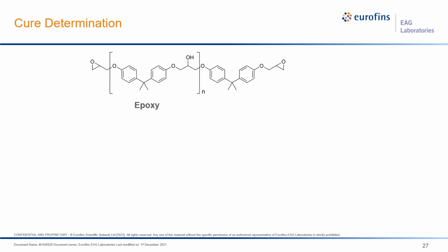Okay, so my last example for FTIR is an epoxy example. So this is a chemical structure of epoxy.